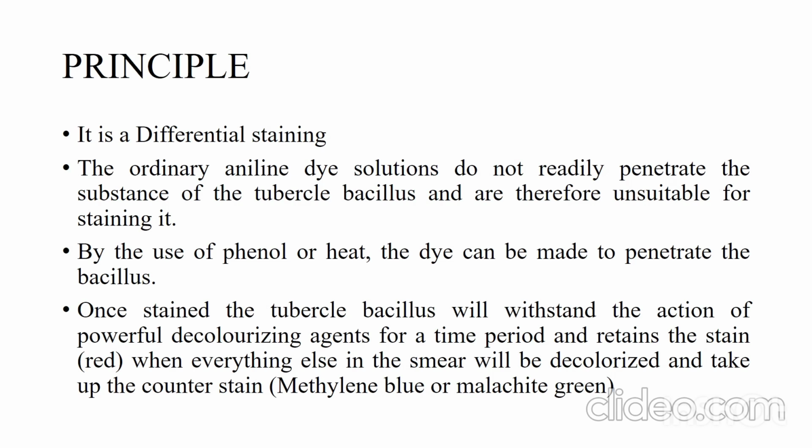But we can make the organism get stained by using strong solutions like phenol, or heat, which act as lipid solvents, so that the stain can penetrate the organism and it takes up the stain. Once it is stained, it cannot be easily decolorized. This gives us a special property to differentiate it from other non-acid-fast organisms.